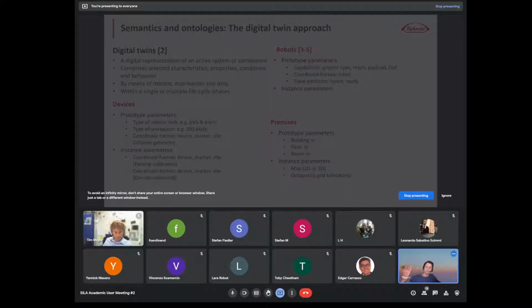So these are parameters that are valid for all of the same model of devices, but that may differ are certain geometrical imperfections. So the possibility has to be kept open to calibrate those positions. And those are then parameters that correspond not to every instance of the same model, but to a certain device.